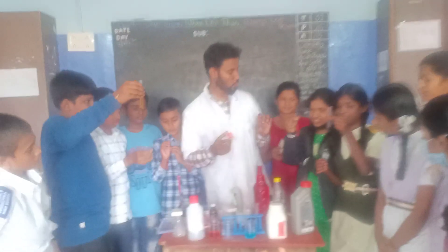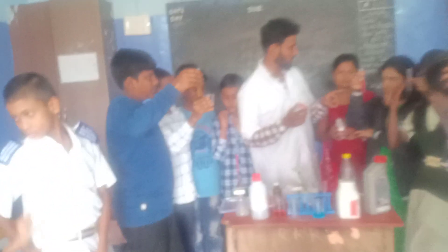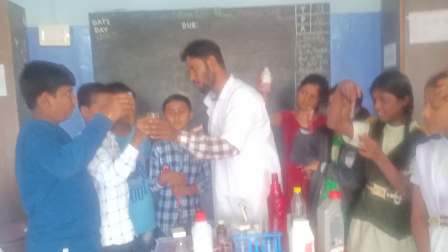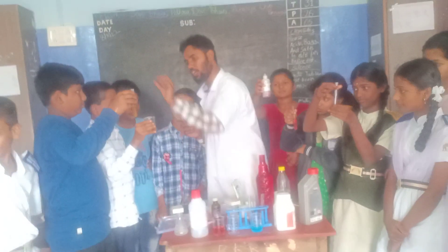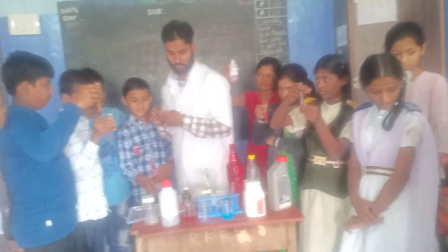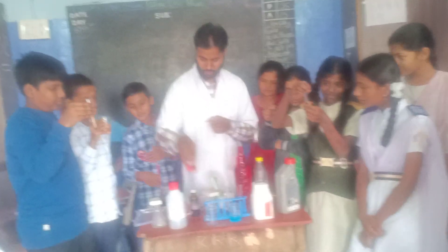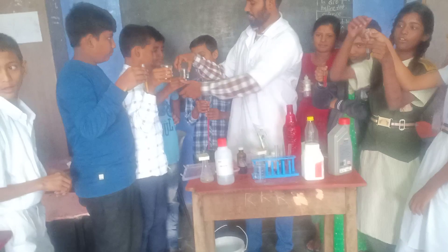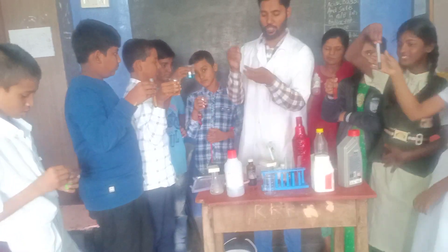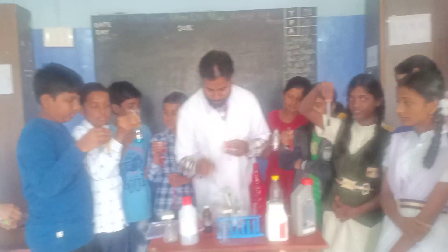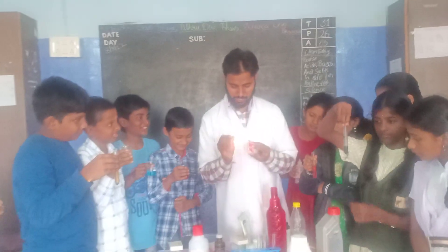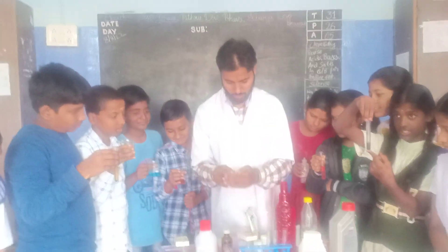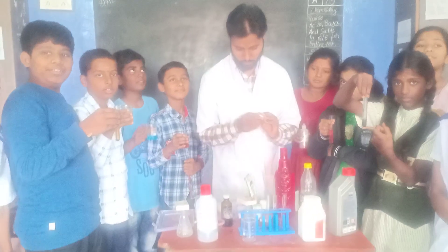Okay, now you can see this is a dark solution. This is hydrochloric acid. After adding the zinc metal into the solution, you can observe the changes taking place.